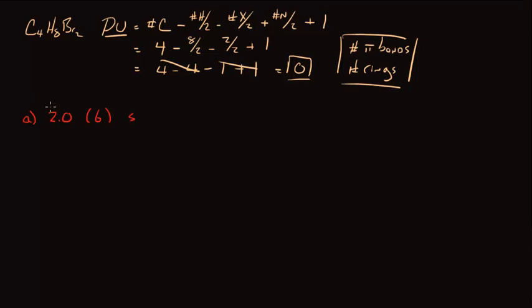Just to remind everyone what these are, this first piece of data is the ppm shift. This second piece of data is the proton count, so the number of protons. And this final piece of data is the splitting, so this is a singlet. And this shows up on the NMR spectra kind of like this. So that's what the S means, that it's a singlet.